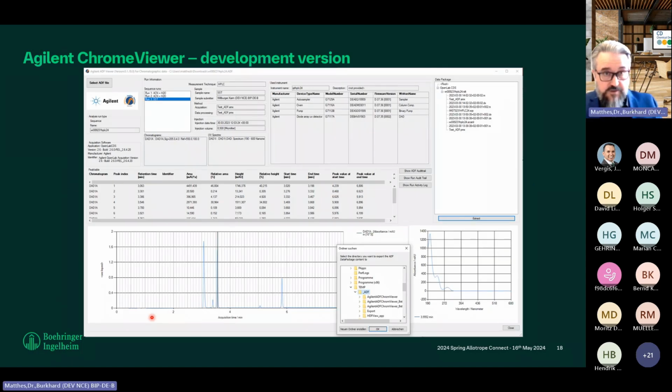The main reason we have been using that Allotrope file format is the viewer software. So when we generate Allotrope files, we also want to review them. And there are 2 major options for reviewing Allotrope files, which is one from the HDF consortium and, from the Allotrope Foundation, of course, the Allotrope viewer. But to be honest, both of those are pretty basic. They offer pretty basic functionality.